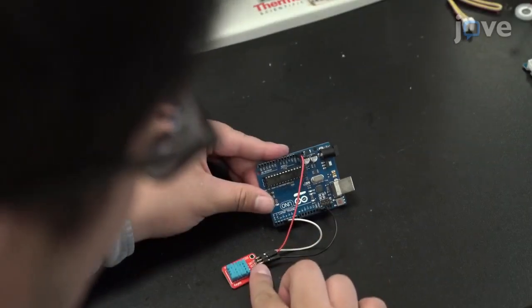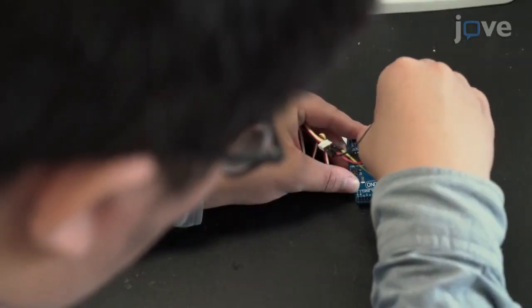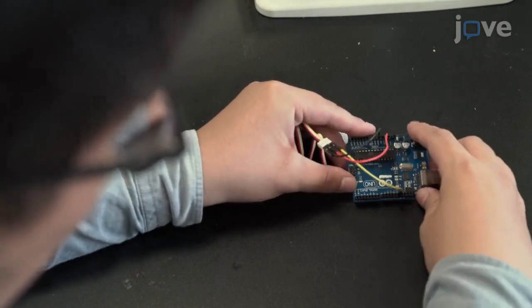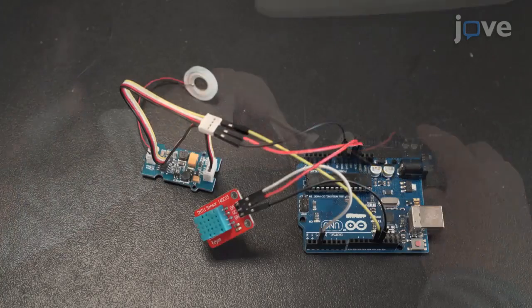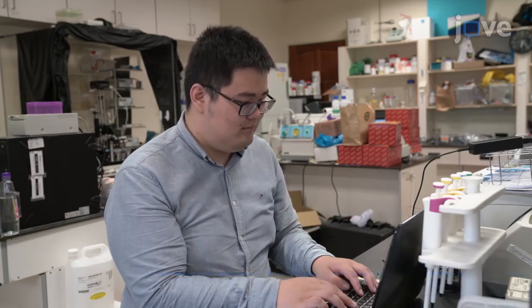We propose to use digital microfluidics as an educational tool because droplets are manipulated on generic electrode array platforms. Users can leverage an extended set of electronic components, now highly accessible for do-it-yourself applications, to electronically interface with the droplets. Demonstrating the procedure will be Yu-Hao, a graduate student from the Yang Laboratory.